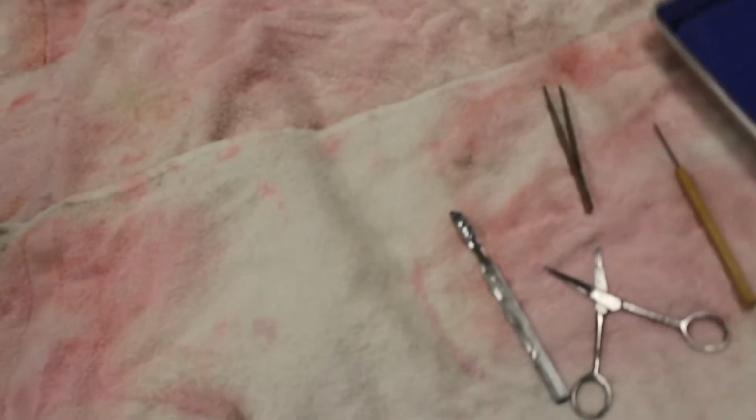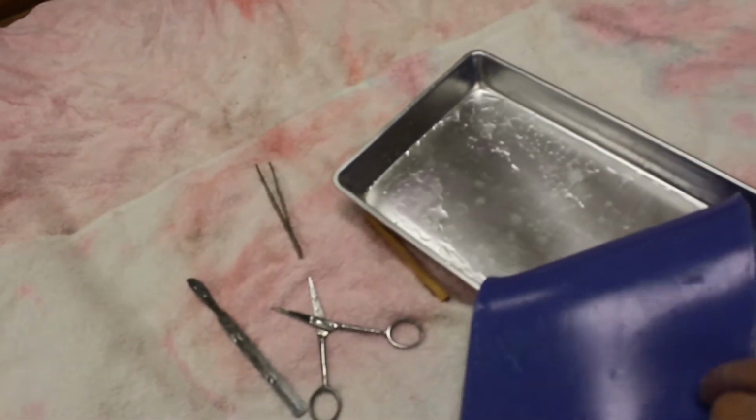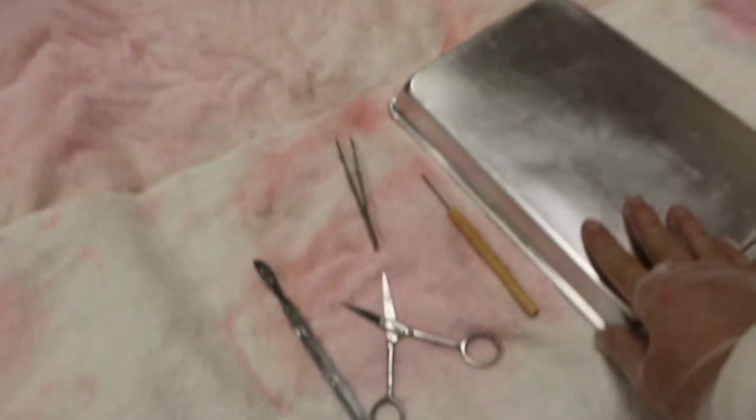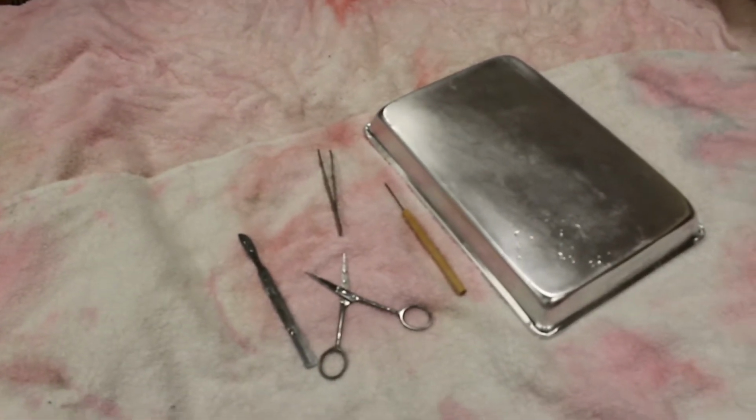And then the trays, you'll just kind of give them a wipe. You can take out these rubber parts and flip it. So flip it to drain and then lay everything out like this. That way it'll be ready for the next class.